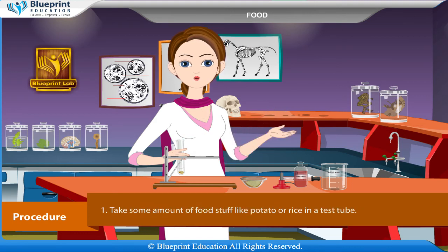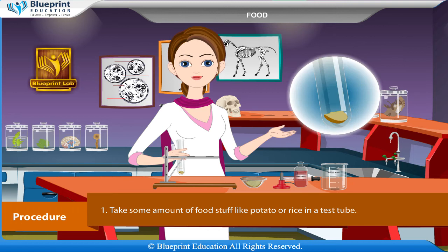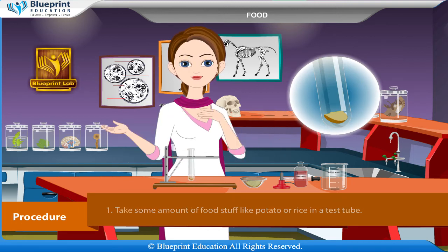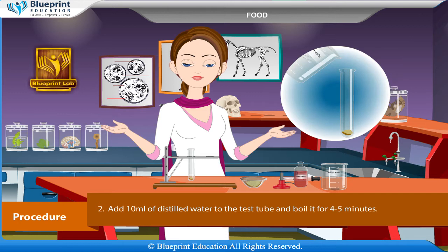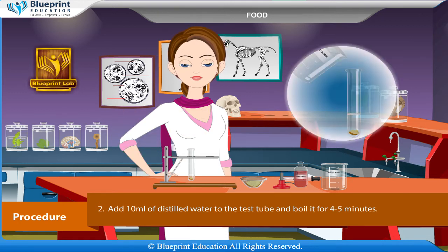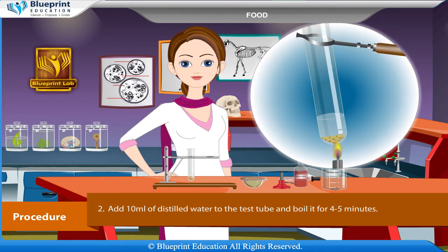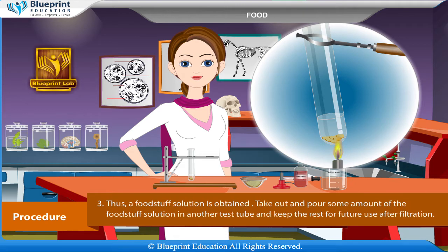Procedure: Take some amount of food stuff like potato or rice in a test tube. Add 10 ml of distilled water to the test tube and boil it for 4 to 5 minutes. A food stuff solution is thus obtained.